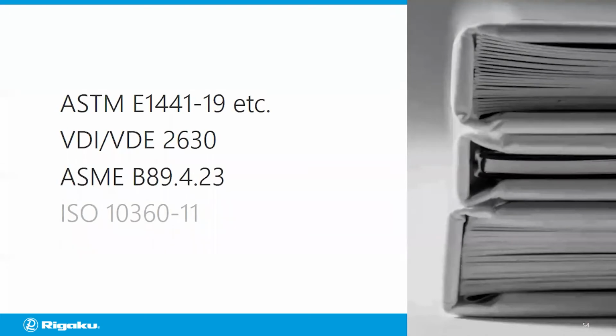So depending on the requirements you have for your project, you can select the correct and appropriate standard for your project, and then just follow them to evaluate how accurate the system you're using for X-ray CT measurements is, and also the software you're using to define the surface and take measurements.